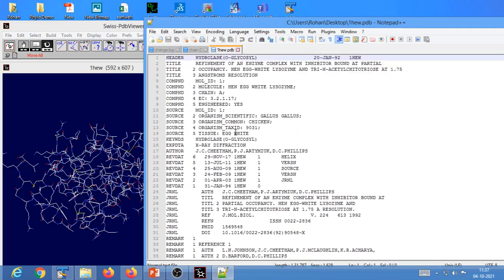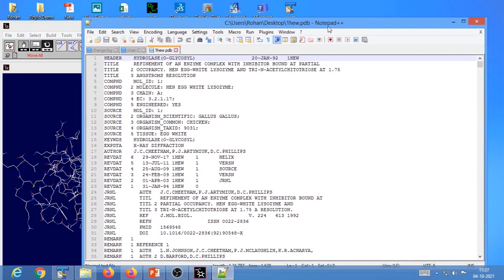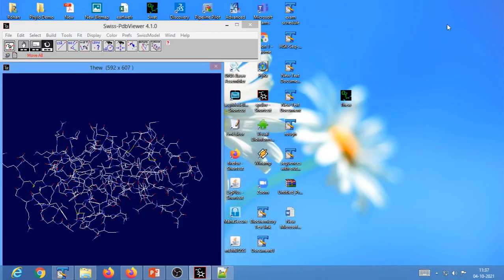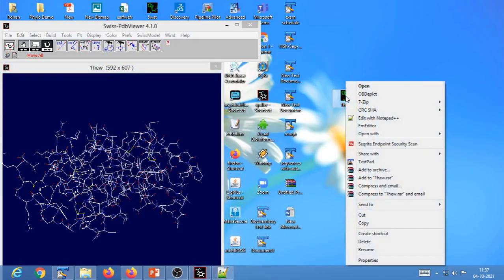Now why do we need specialized software for visualization of the textual data that is arranged? You can ask yourself a question like, I do have a default text editor in my Windows system, that is, I can see it in Notepad also. Then why do we need a separate text editor?